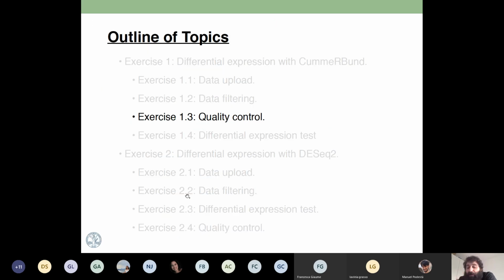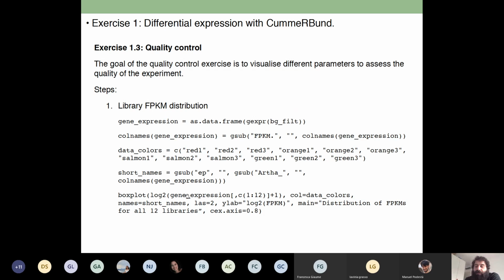Okay, now comes the quality control. As I said, I was doing this during the weekend, because when I was originally selecting the data sets, I wanted to select a data set with 3 replicates, where the 3 replicates have more or less the same number of reads. That was fine. And then with different accessions we can do these pairwise comparisons in a different way. So I thought, well, this experiment was good. So you will see what pops up from this.